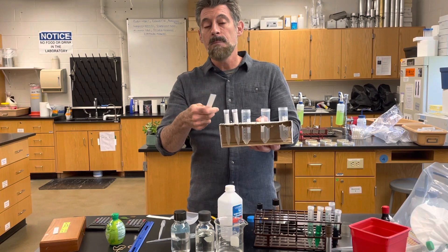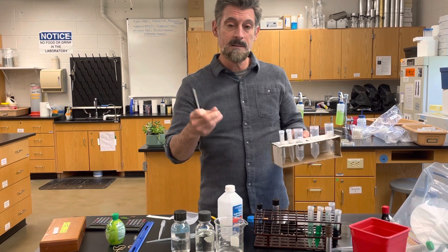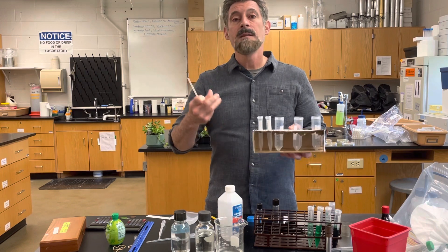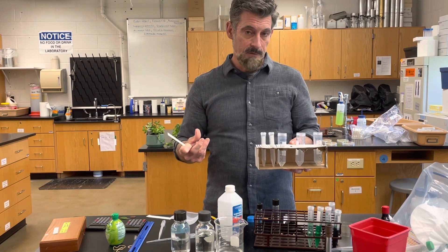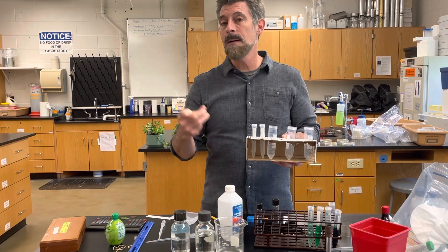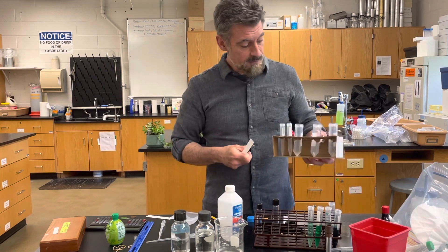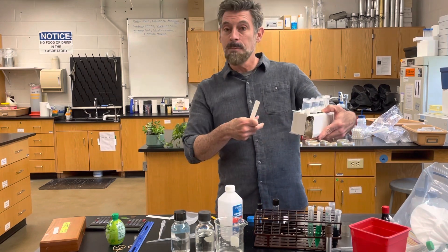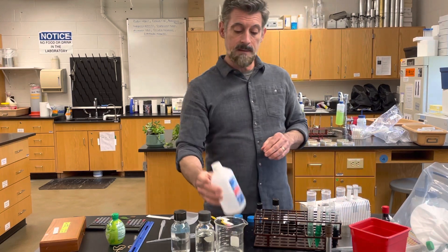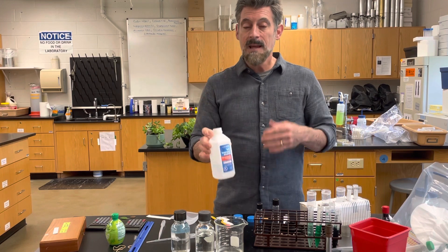You're going to come up with different solvent systems. That means you're going to get different types of liquid that are going to solubilize the different pigments within the leaf — within the chloroplasts — and then try to separate them. At home you're going to use a variety of things you might have, like isopropyl alcohol, which almost everybody does, and some other things.